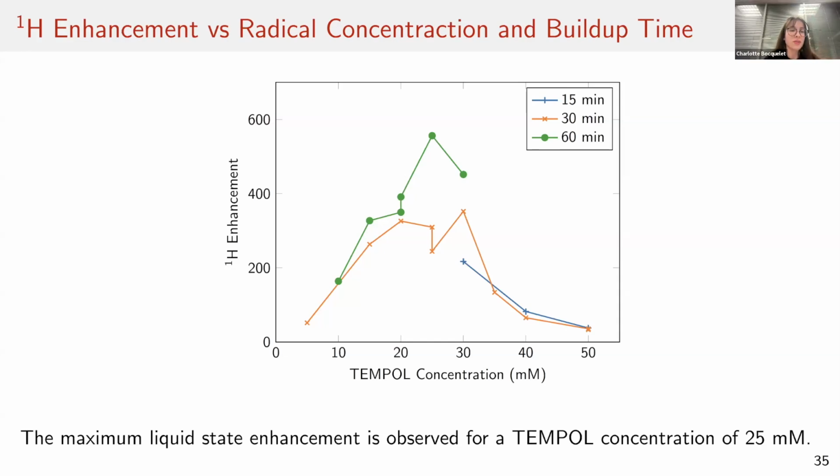There is another question from Balvinder. Thank you for the interesting and explanatory talk. He's asking how much time it takes to optimize your sequence and everything for a new sample if it's not labeled, and which other molecules other than pyruvate have been detected with lower limit of concentration.